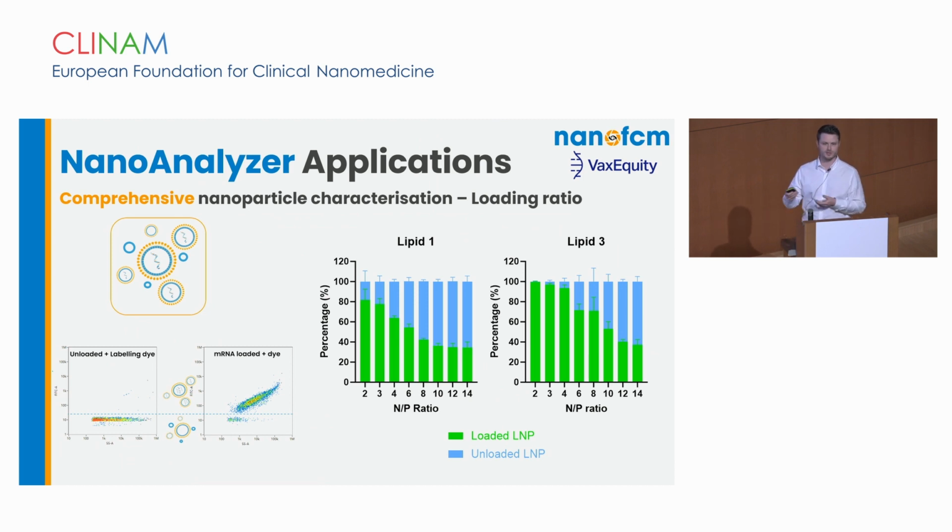You could look at that in a couple of ways. One might be that here we're seeing wasted reagents, large excess lipid that's being added that's unnecessary. You might also look at it as a contaminant, additional particles in there that aren't carrying our payload of interest.